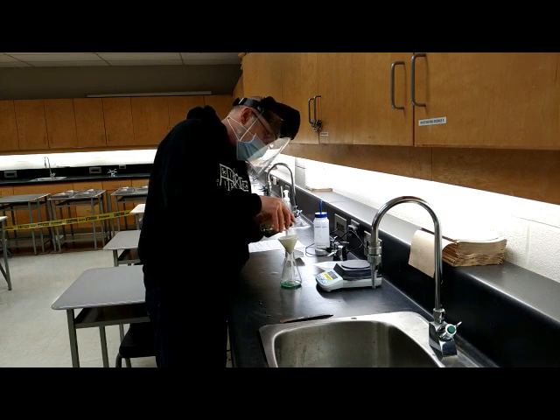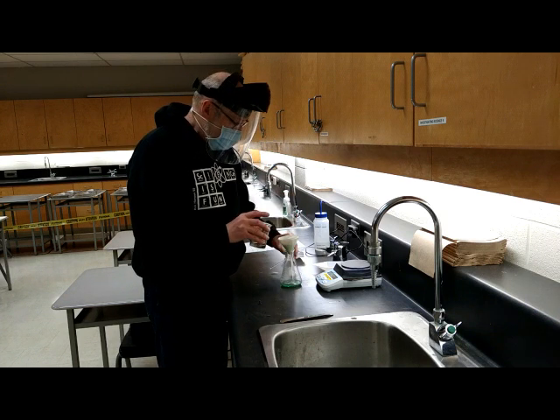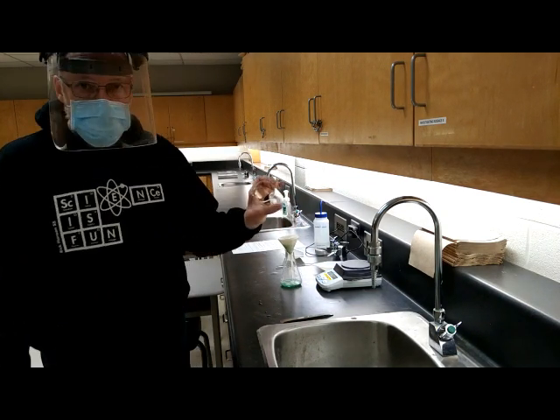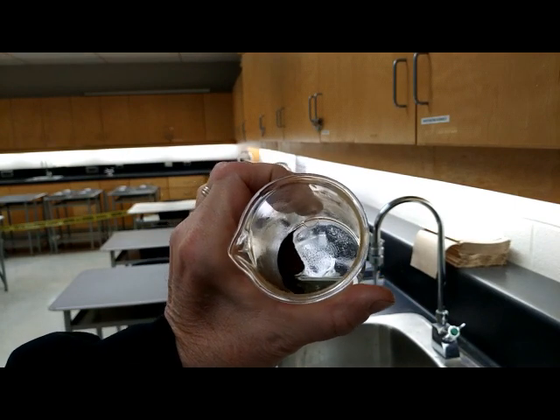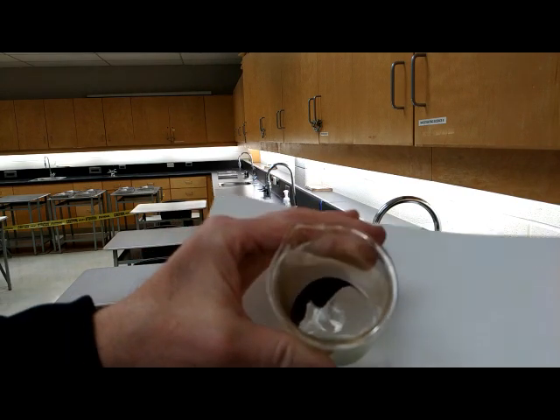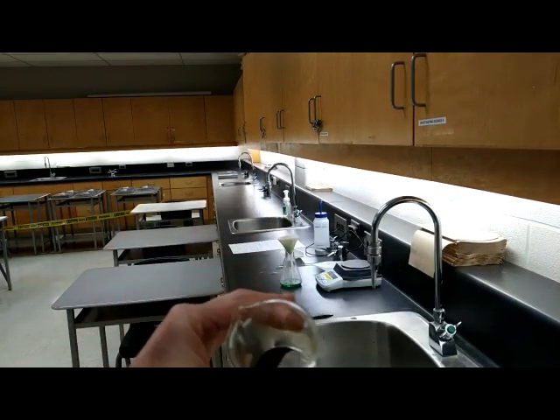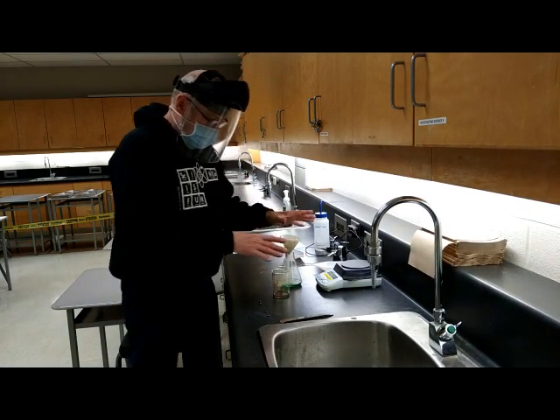I'll pour a little bit more on. And so now what we've got, and you can see this quite well, I'll bring this closer to the camera, we've got that copper sitting there at the bottom of the beaker with some of the liquid. It's definitely that brown copper color. Again, I'll show you the white background. Hopefully you can see that in the video. All right. Okay, so I'm going to let that pour out.